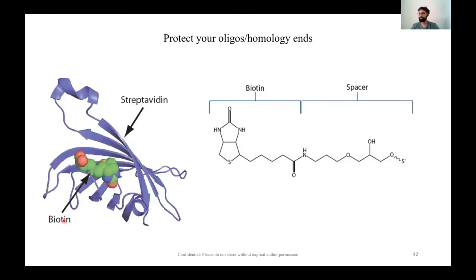Nevertheless, like I said, this biotin would conjugate with the streptavidin tagged Cas9 protein that you have on the oligo. And this also has basically a spacer, right? A spacer region.